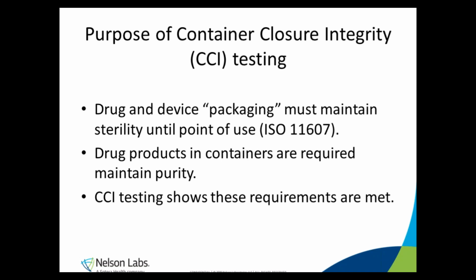Why would you do CCI testing? Well, ISO 11607 says that drug and device packaging must remain sterile until the point of use. If your package is a pouch or a tray, you'd use maybe a bubble emission test or dye migration test to show package integrity. But if your packaging is a glass vial or a syringe, then you'd use a CCI type test to show package integrity.